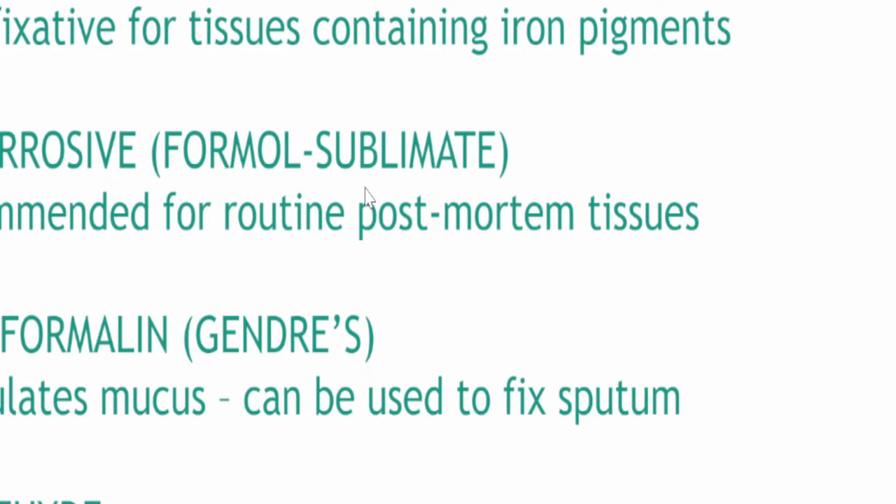Okay? Ano pa ba yung mga samples that are rich in mucus? Bigay nga kayo ng isang sample. Give me a pathologic state. A person with caseous tuberculosis, right? A patient with caseous tuberculosis, who obviously has already died. Okay, but for the purpose of studying what occurred during the person's death, to better understand it, you want to coagulate the mucus so you can see what happened to the remaining lung tissue, di ba?